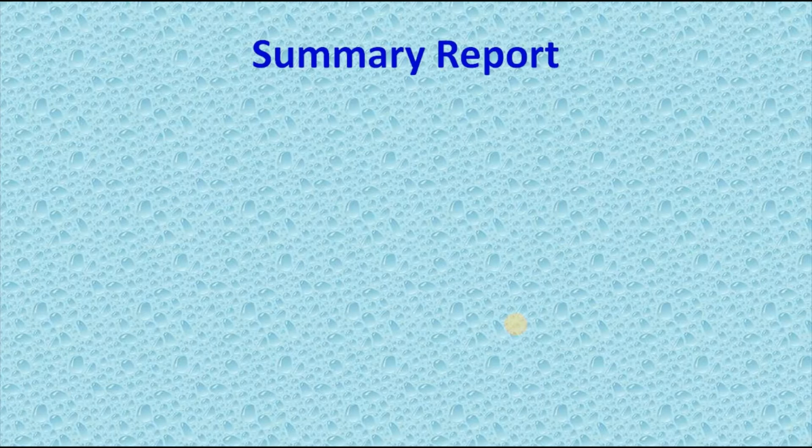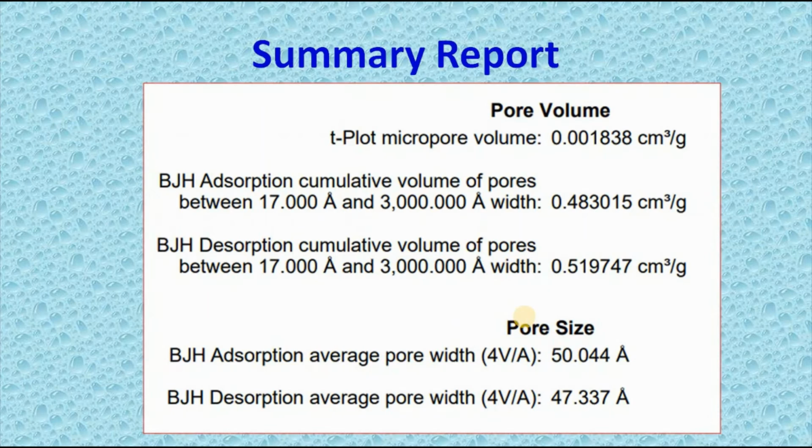Well, then it also produces a summary of pore volume, which involves BJH adsorption and desorption cumulative volumes of pores, and it also produces a report on pore size considering BJH adsorption and desorption.